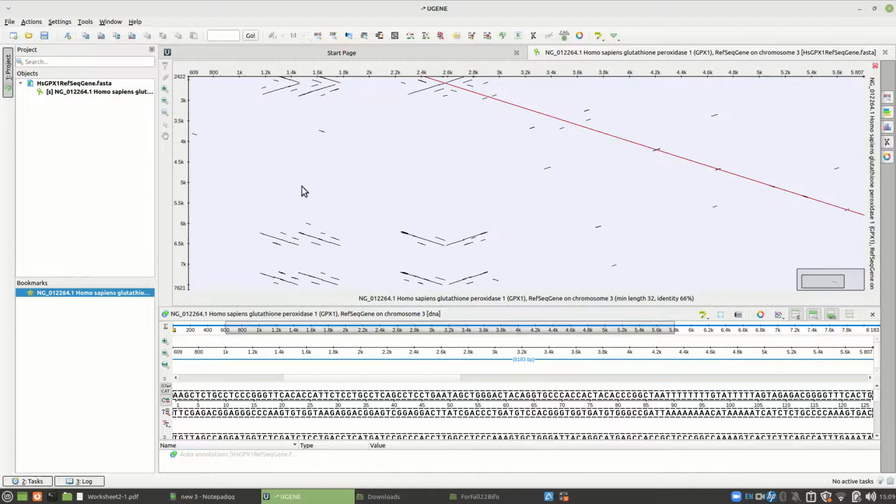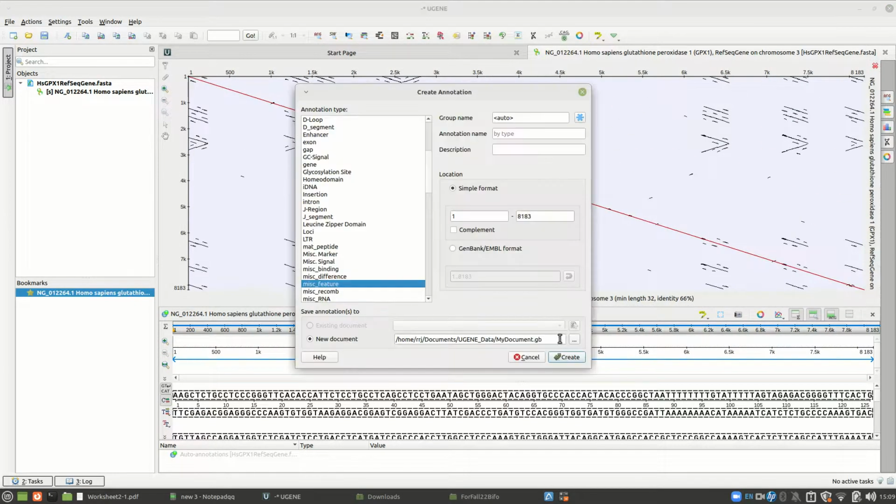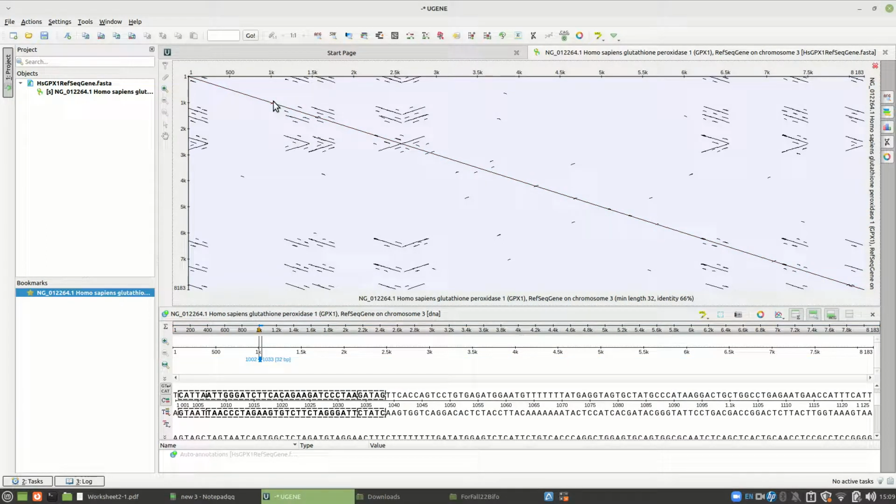And I'm not getting it. You have to maybe zoom in. You can use your scroll bar. Oops, didn't mean to do that. I think I got it there. If you can see there's just a little bit of red there, that means I was actually able to get just that region. And here is the piece.